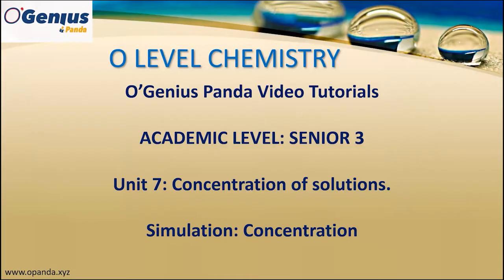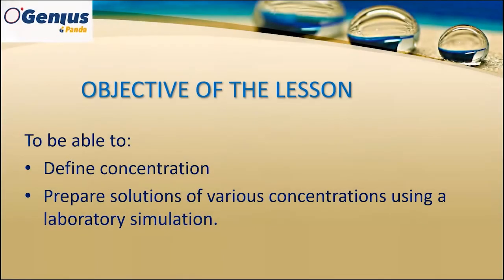In this lesson, you will learn concentration. The simulation we are going to explain today is concentration, and this concept is studied in Senior 3 according to the Rwanda Education Board curriculum under Unit 7, Concentration of Solutions. Here we have the objectives of our lesson. At the end of this lesson, you should be able to define concentration and prepare solutions of various concentrations using a laboratory simulation.